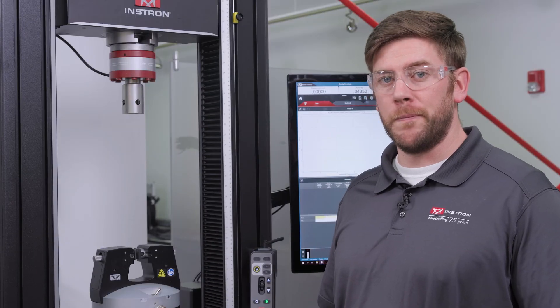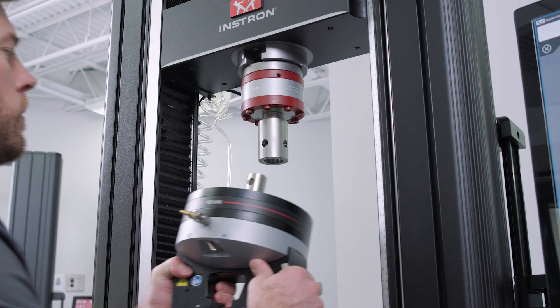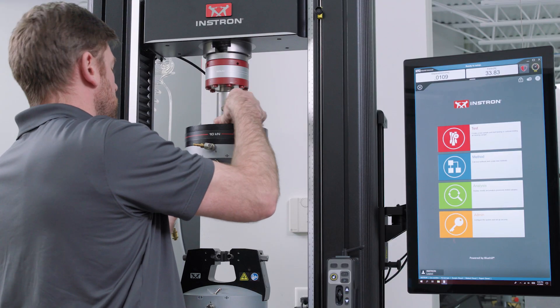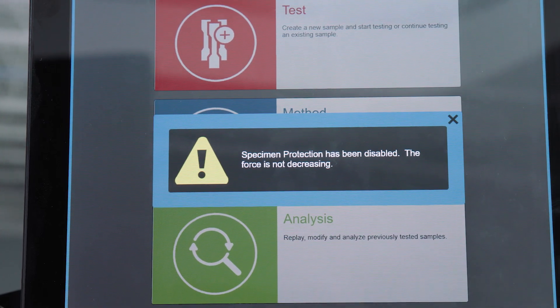I want to add a quick reminder. There are times you wouldn't want to have Specimen Protect enabled. For example, if Specimen Protect is enabled while changing out a grip or fixture, the crosshead will begin to move slowly as the system attempts to remove the load from the load cell. However, in this instance, Specimen Protect will automatically disable itself and stop the crosshead movement if the load doesn't decrease within a couple seconds.